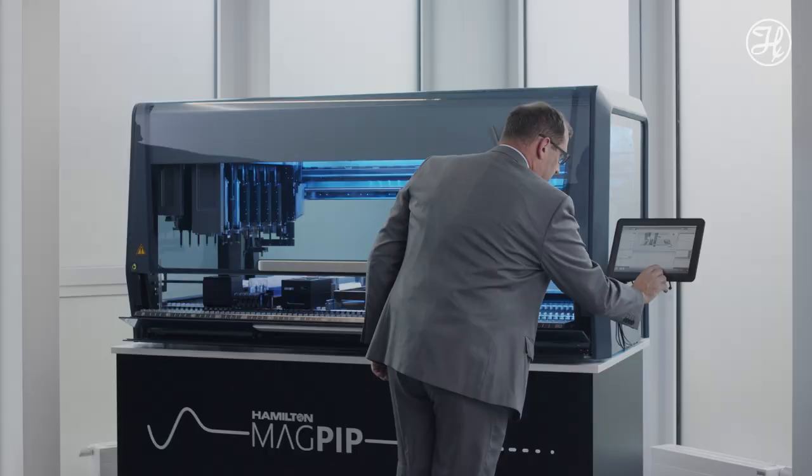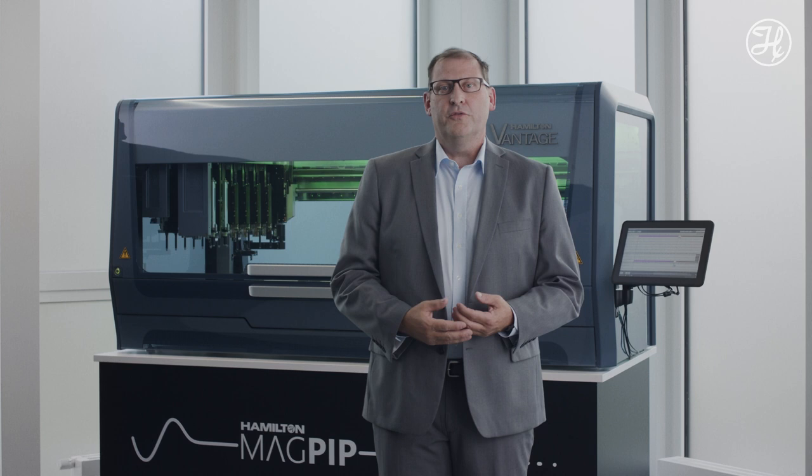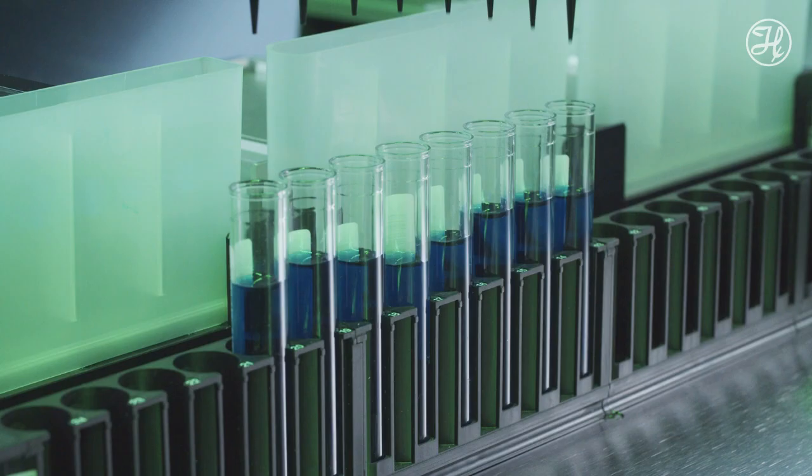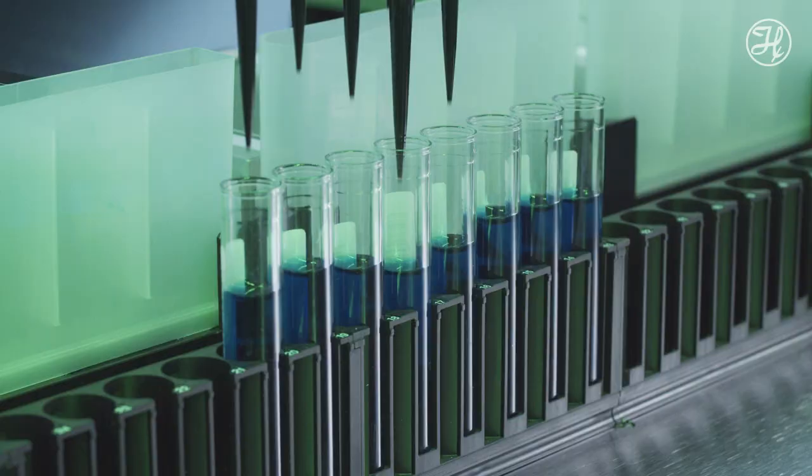Liquid transfers with a volume of up to 750 µL are supported in the conventional air displacement procedure. Here, the piston pushes a volume of air in the liquid just like in your hand pipette, thus controlling the delivery of liquid. Fine adjustments are made as usual via the liquid classes, which allow you to set certain parameters and optimize the pipetting steps according to your needs.